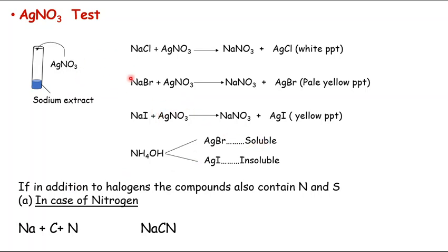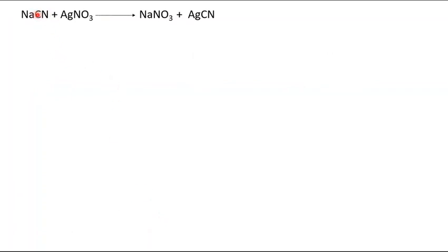Besides halogens, if the organic compound also contains nitrogen or sulfur, there is an interference problem. If nitrogen is present in the organic compound, sodium fuses with nitrogen and carbon to form sodium cyanide (NaCN). So besides sodium chloride from the halogen, we also get sodium cyanide. Sodium cyanide can react with silver nitrate to give silver cyanide, which is also a white precipitate, causing confusion.